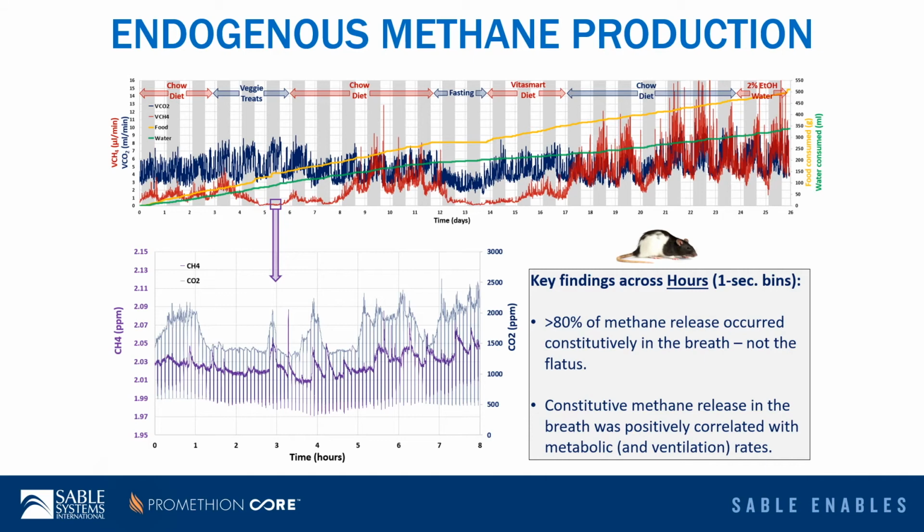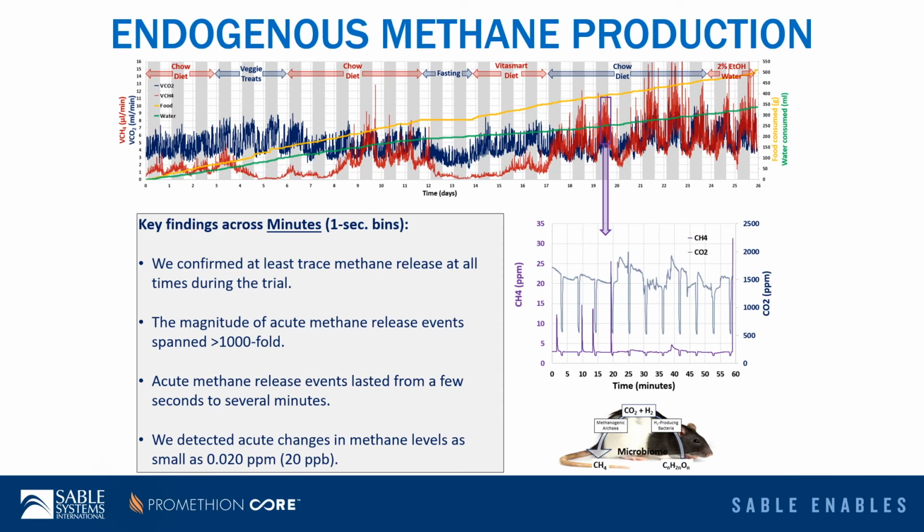You see that those lowest methane levels in the trace represent the background or ambient concentrations of methane. And we can see this large constitutive methane signal during this entire period, this 8-hour period at least. And if we zoom in even closer to a 1-hour time scale, we can clearly identify the individual flatus events that only last for a few seconds, as you might expect.